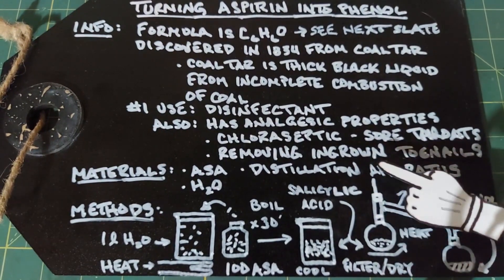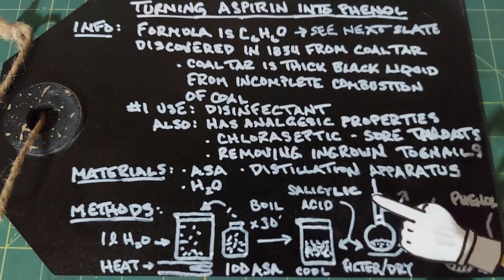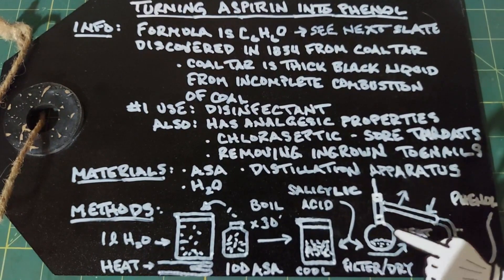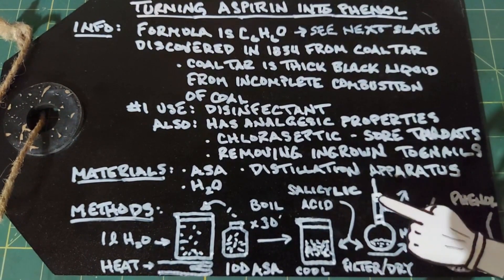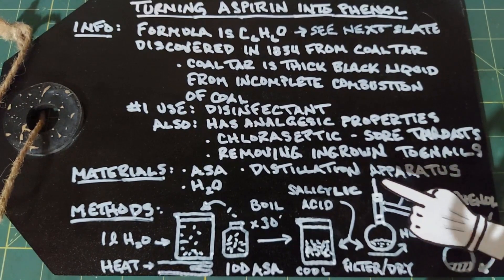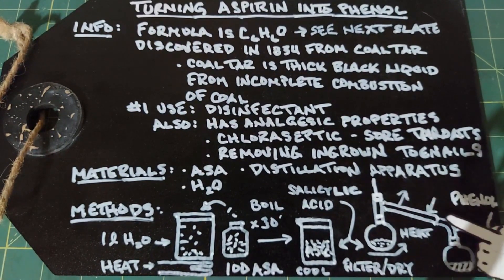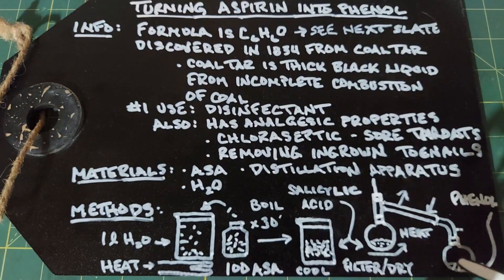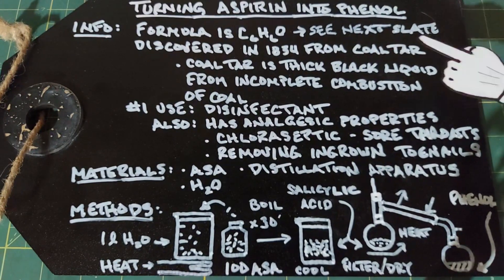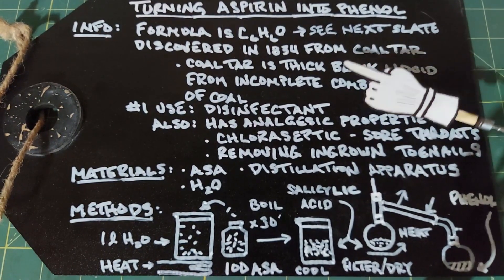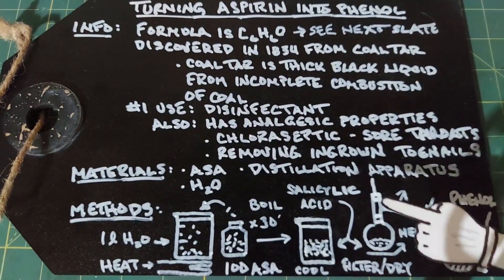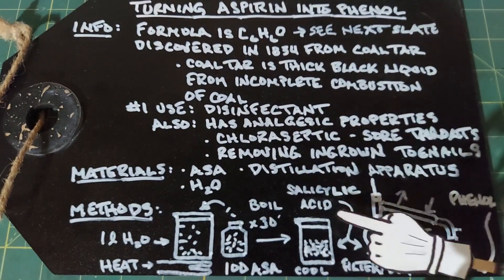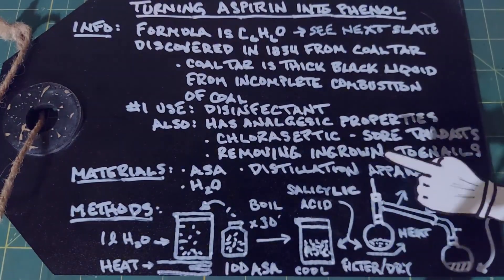Once your salicylic acid is dry, put it into your distillation apparatus in the flask and heat it — get it really hot. Somewhere between 150 and 200 degrees Celsius, the phenol will start to come over and drip into your round-bottom flask on the other side, and there's your end product. When you think about it, we're just boiling aspirin and then distilling the product, so overall the method is actually pretty simple.